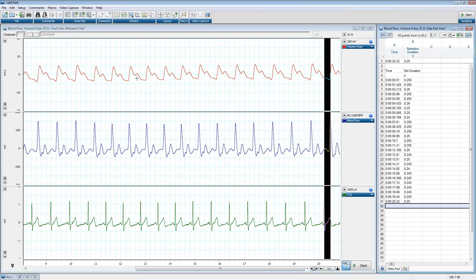And our macro is written. So that's an example of an intermediate macro with a few more steps involved. And we're able to find the time difference between 2 points automatically throughout an entire file.